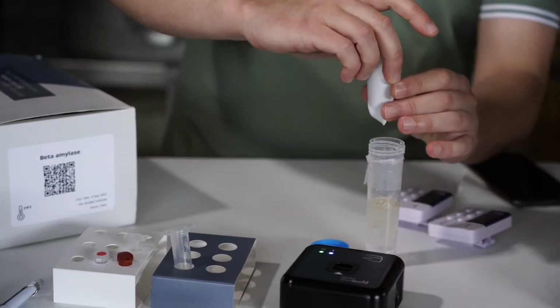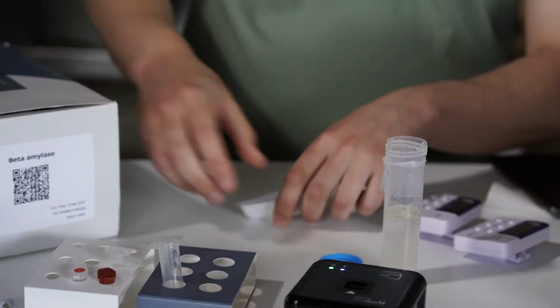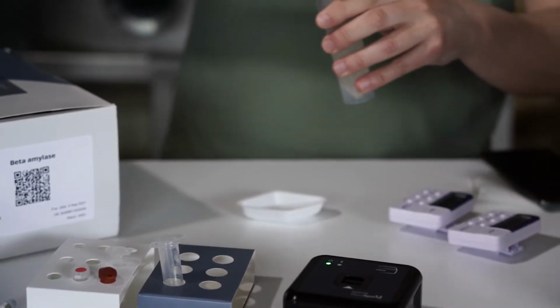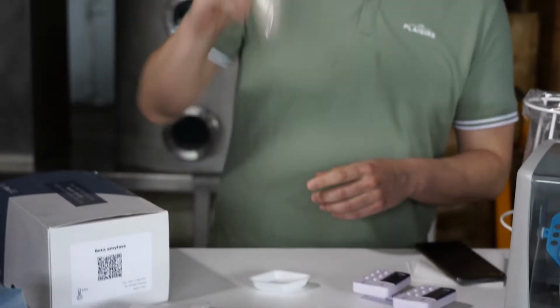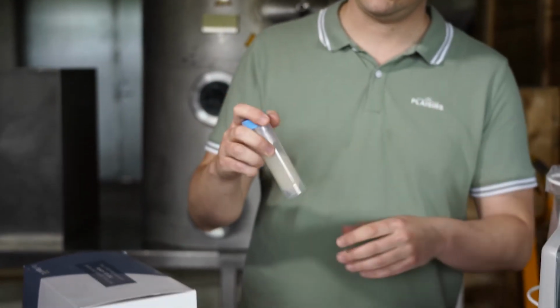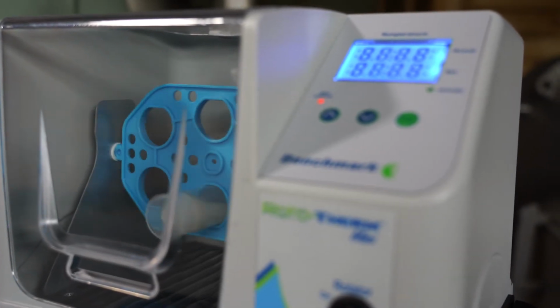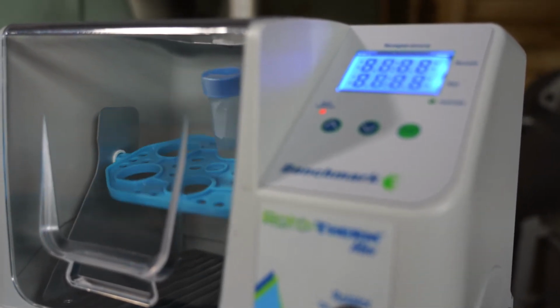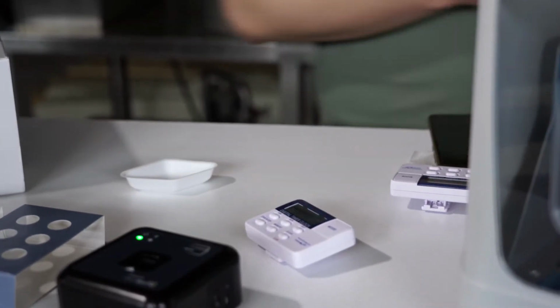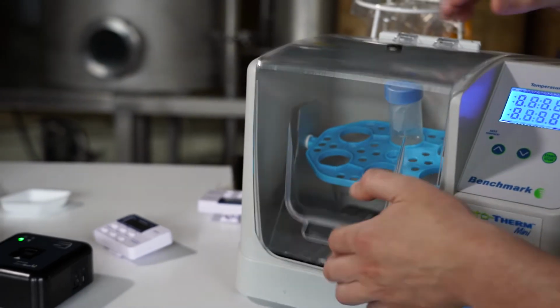And then the next step, add your malt into the buffer. Make sure that everything is inside. And then you shake it for just 5 seconds to make sure that it's homogeneously distributed in the extraction. Timer stopped, and what we will do is we take the tube out.